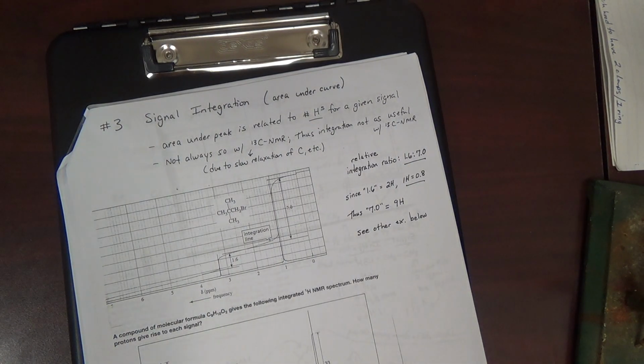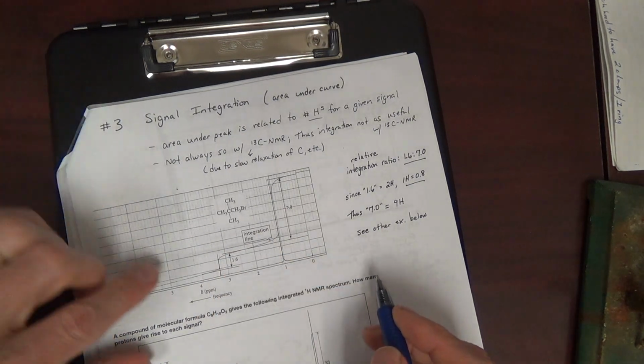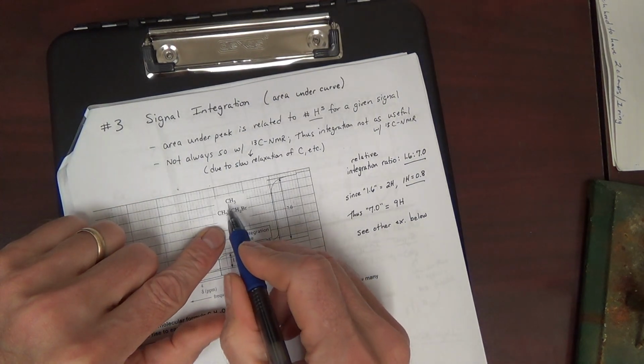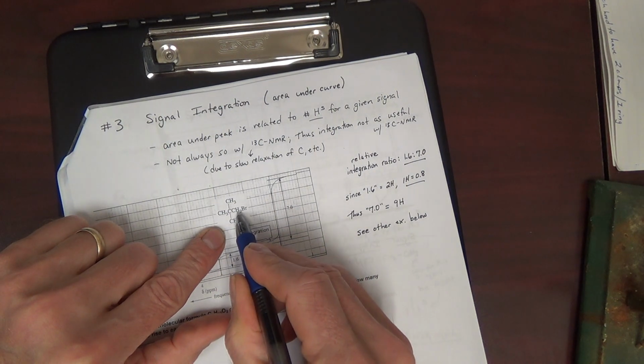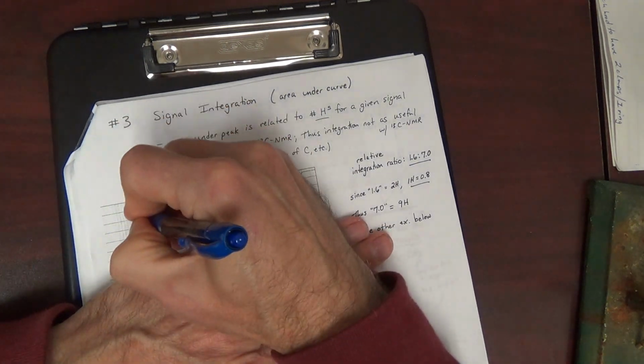Let's look at the integration for a proton NMR. Let's look at this compound here. Number of signals: I expect one signal for the methyls and one signal for the CH2. Right? Two signals.